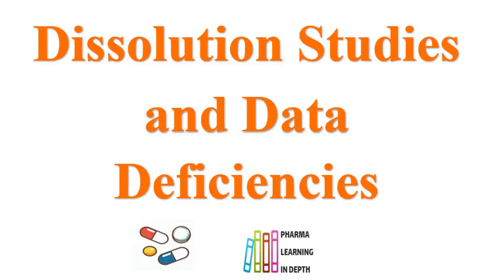Many times, though the dissolution data is submitted, the agency may ask you to generate more data or to tighten the dissolution specifications. So whenever filing the formulation, you should know all the dissolution requirements.